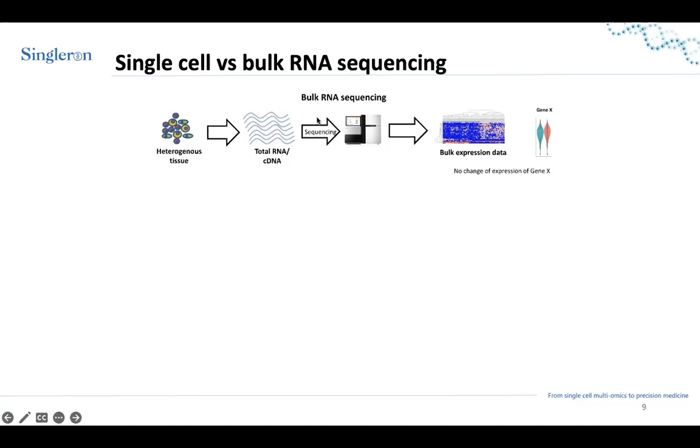So you follow a certain protocol, and then you do the sequencing, and after sequencing, you get what we call the fastq files, which are the output of the sequencing step. So you get the fastq files that contain the sequencing data. But this sequencing data needs to be pre-processed before being able to be analyzed.